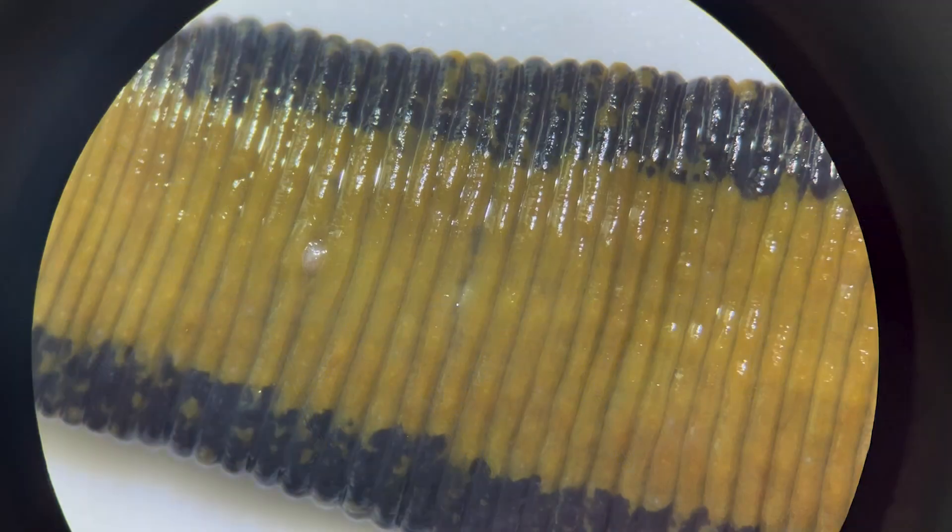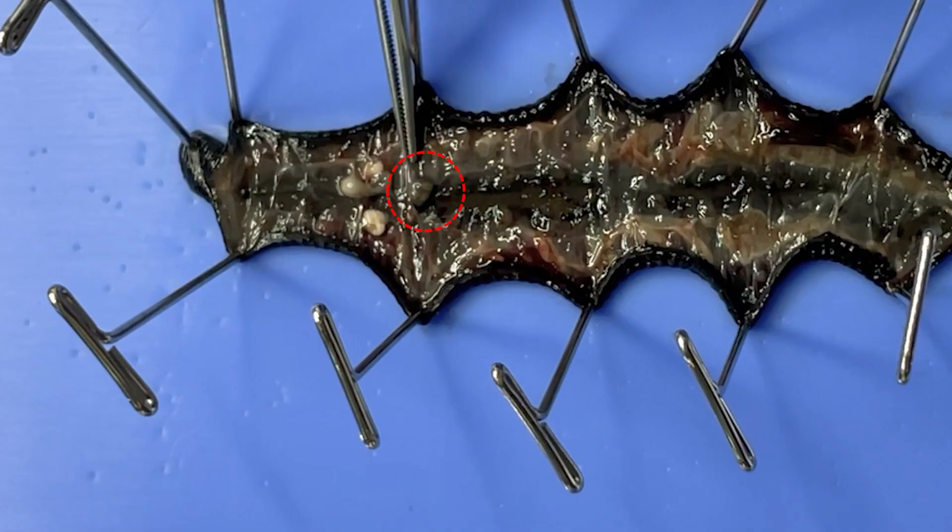The male genital pore is located below this area. And below that, there are the female genital pore and connected ovaries.